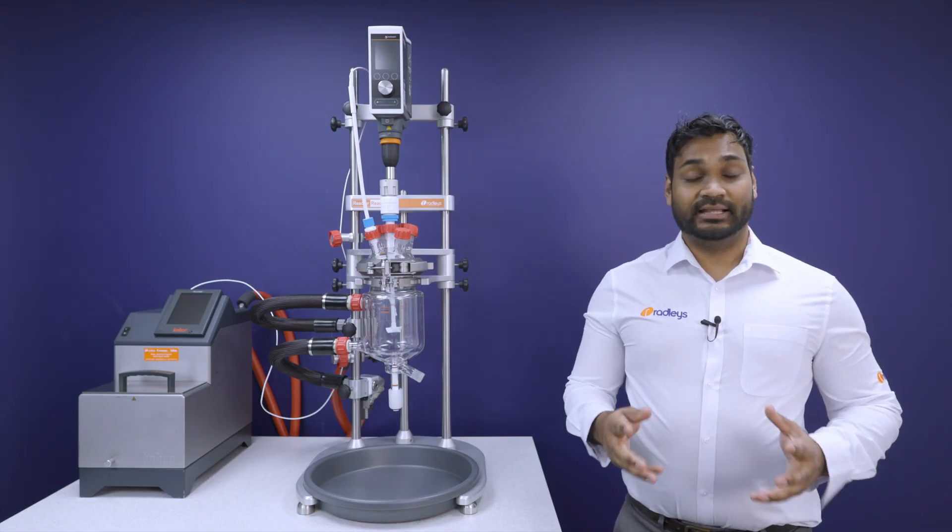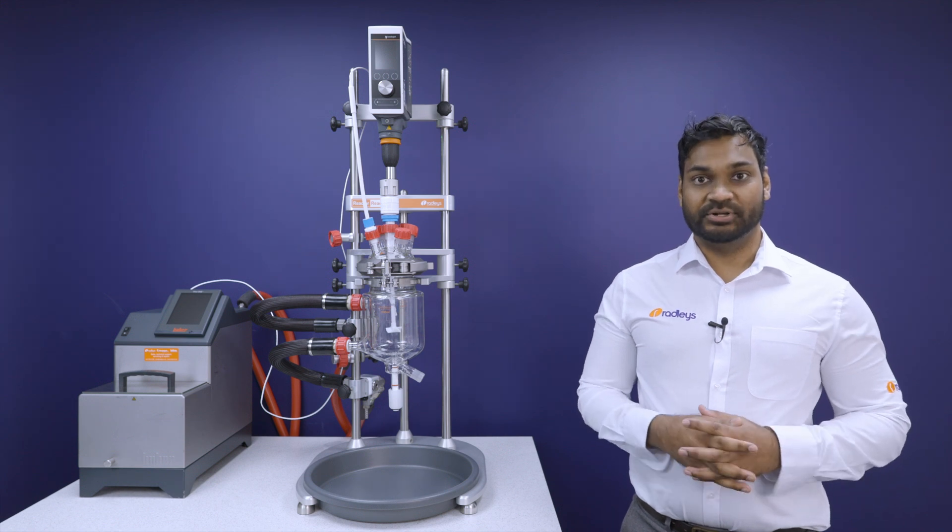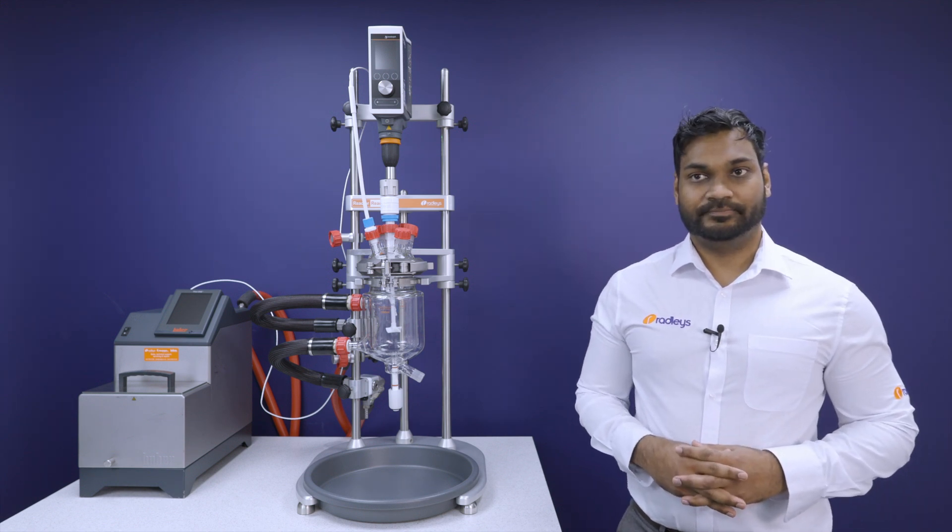All our vessel kits include an impeller that is matched to the vessel, meaning you get the optimal dimensions and geometry for your particular setup. It also means that you can easily change the volume of your process by simply swapping out your vessel for one with the same geometry.